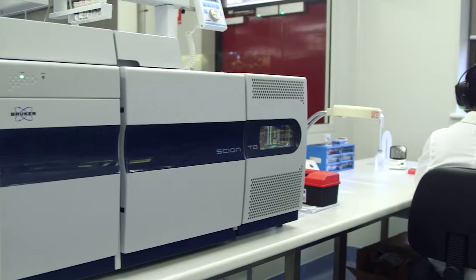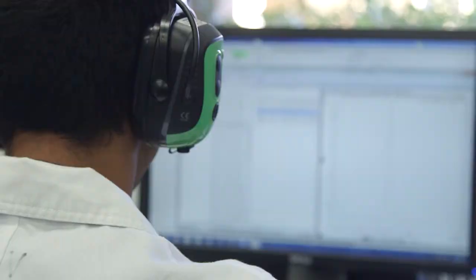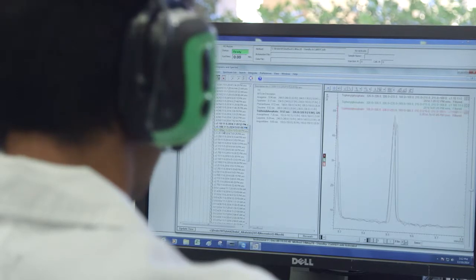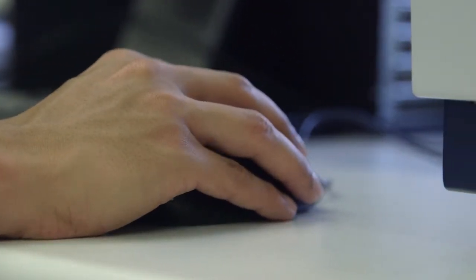Metabolomics per se is the attempt to measure as many of the molecules or compounds in complex systems as possible, so that we can work out which molecules are outside of their normal ranges, or which molecules or compounds are causing or being affected by a disease, from human health right through to agriculture and beyond. We can start to look at environmental health, etc. as well, using these techniques.